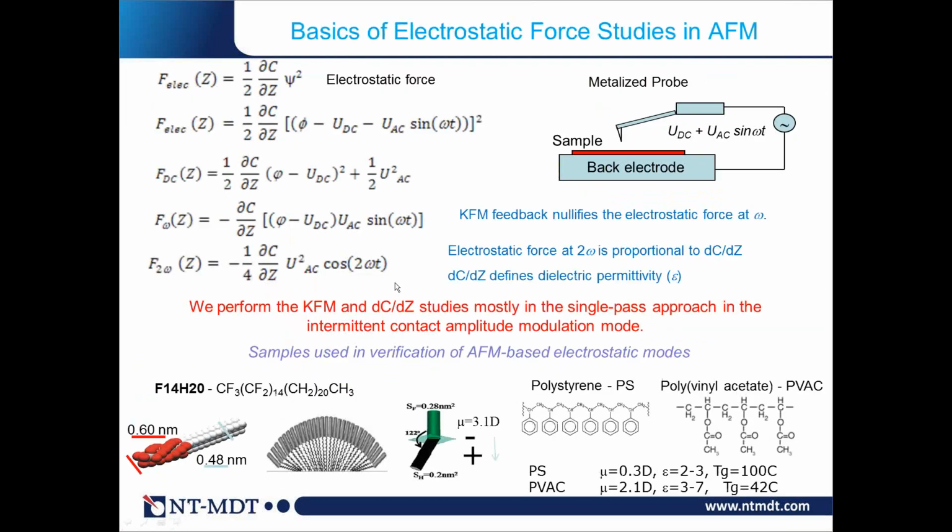Now I'm switching gears to electric modes. Again, this is a very tricky general situation. Of course, I would like to deliver you the latest and the best, but I will restrict myself only to some general description of this field, because we are thinking, within a month or two, to prepare a more defined, more specialized webinar about multi-frequency measurements in AFM, in particular with emphasis on electric modes.